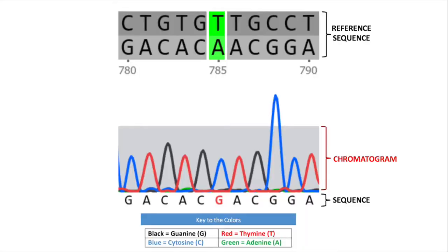And now on to Genome Compiler itself. Genome Compiler is a tool that will allow us to look at both the letters, the sequences, of our DNA fragments, as well as a related trace file called a chromatogram.